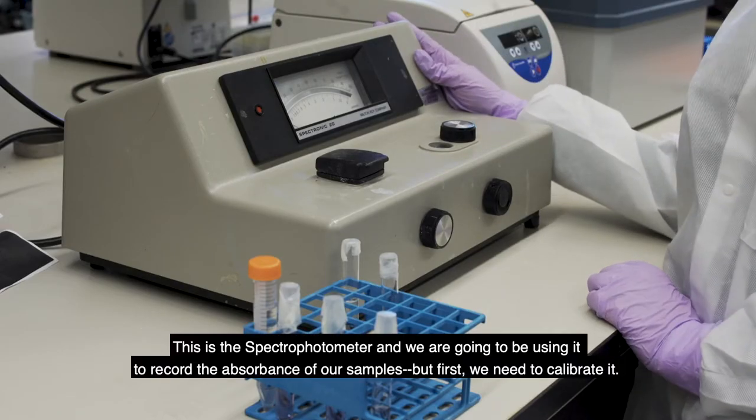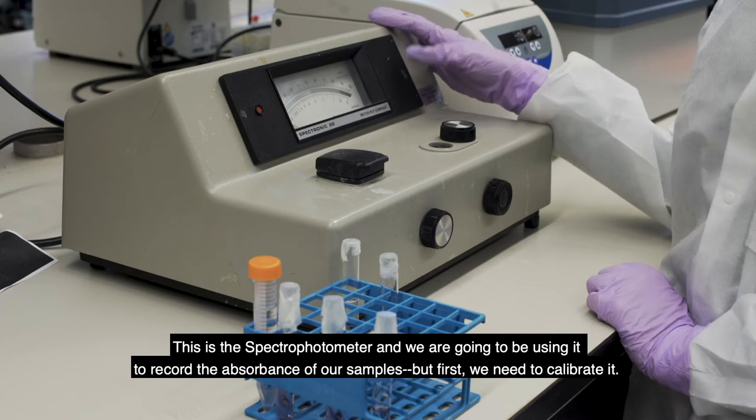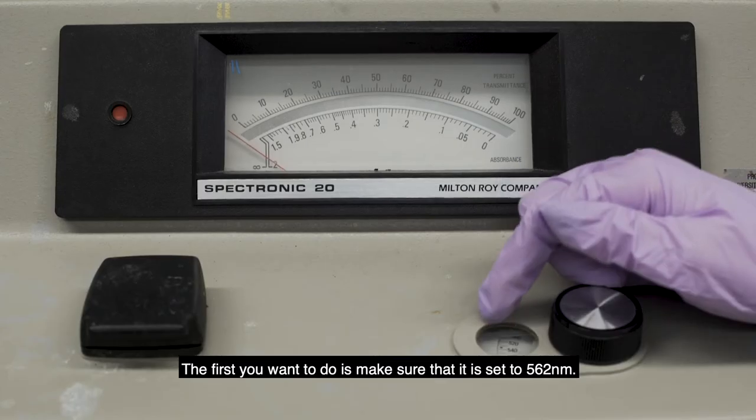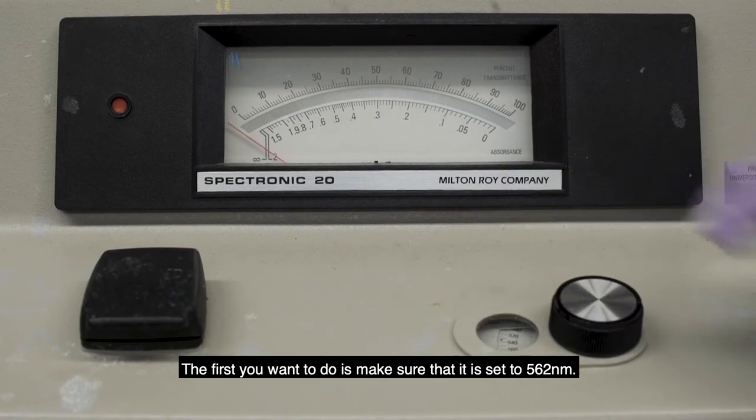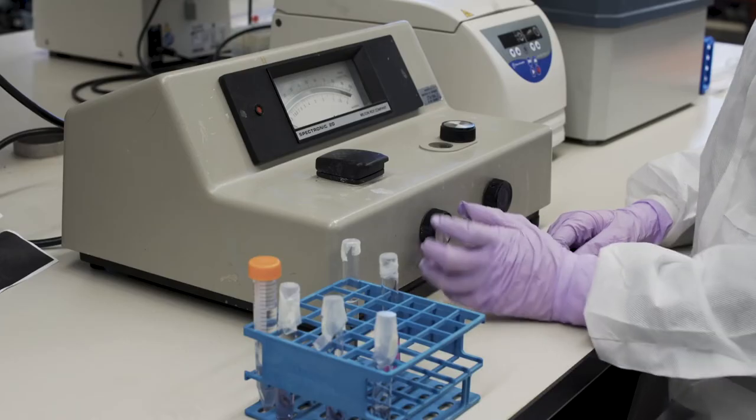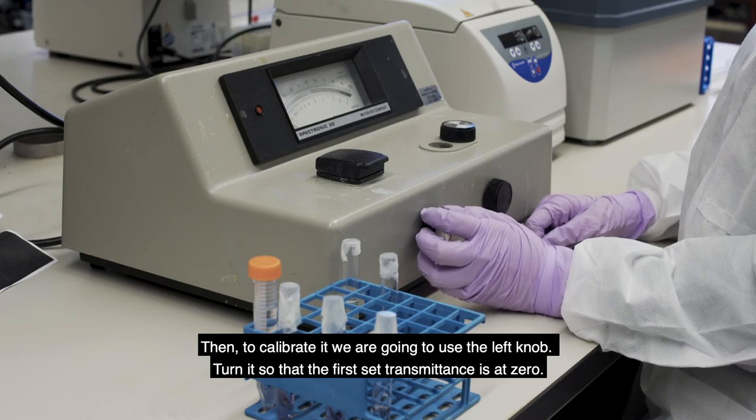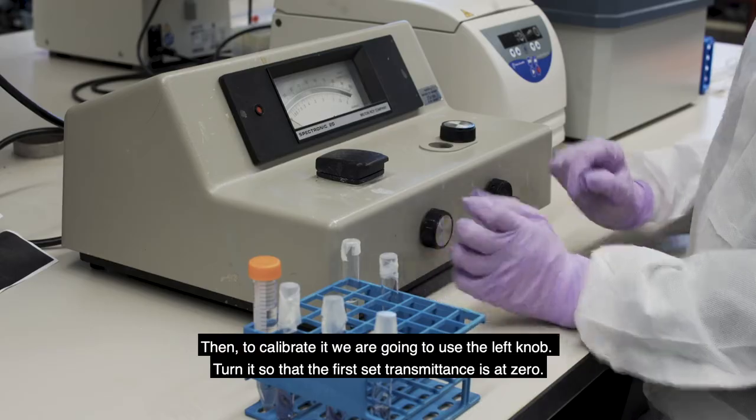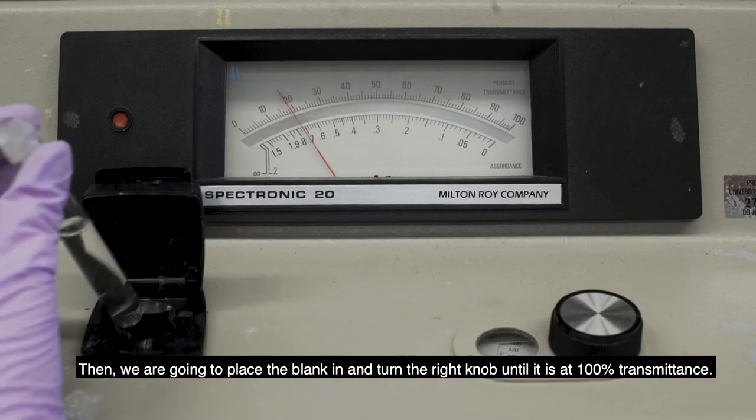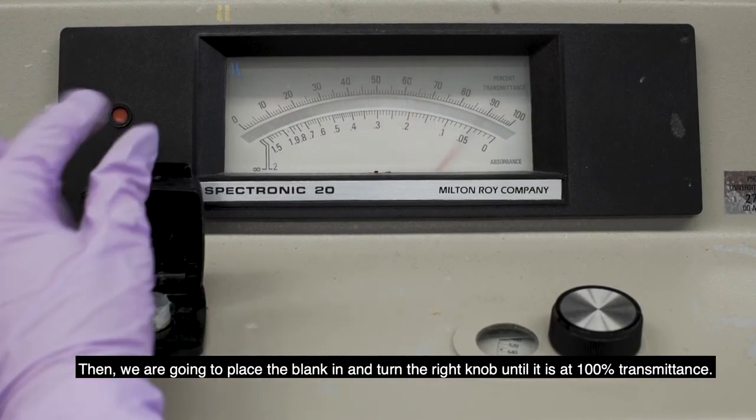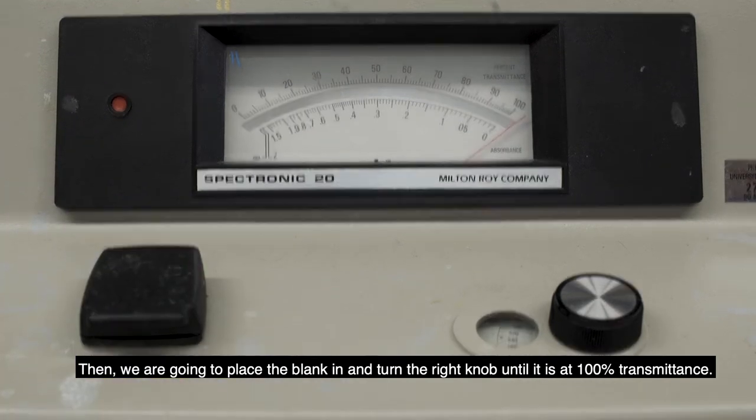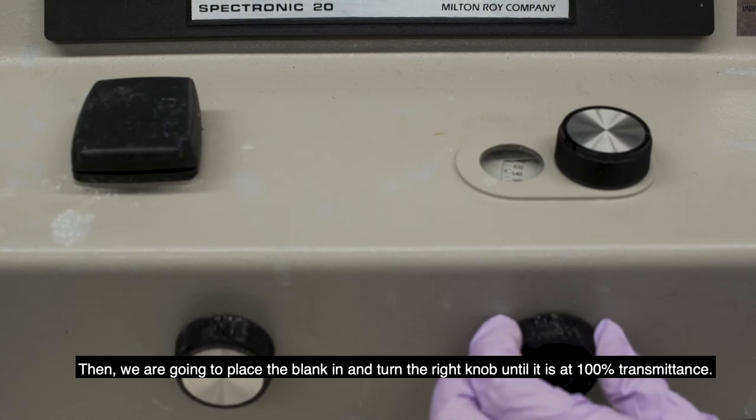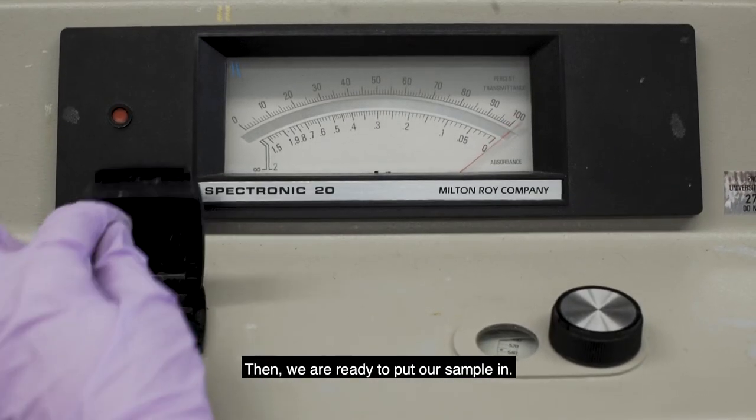So this is the spectrophotometer and we're going to be using it to record the absorbance of our samples, but first we need to calibrate it. So the first thing you want to do is make sure that it's set to 562 nanometers. And then to calibrate it, we're going to use the left knob and then turn that so that the percent transmittance is at zero. Then we're going to place the blank in and then we're going to turn the right knob until it's at 100% transmittance and then we're ready to put our sample in.